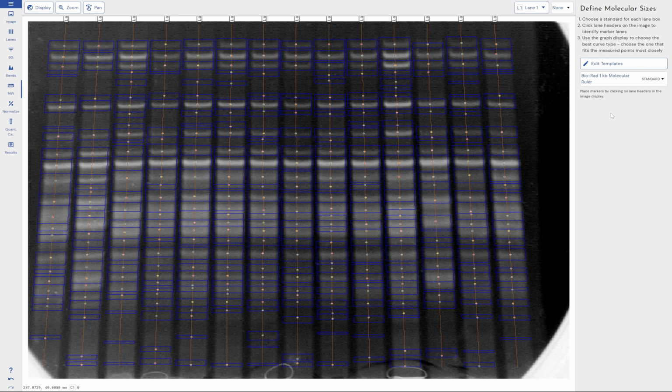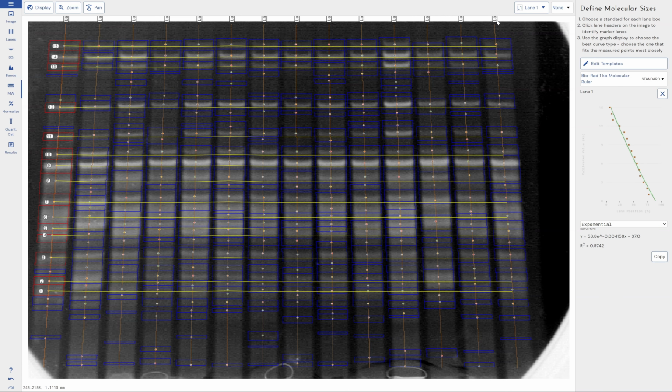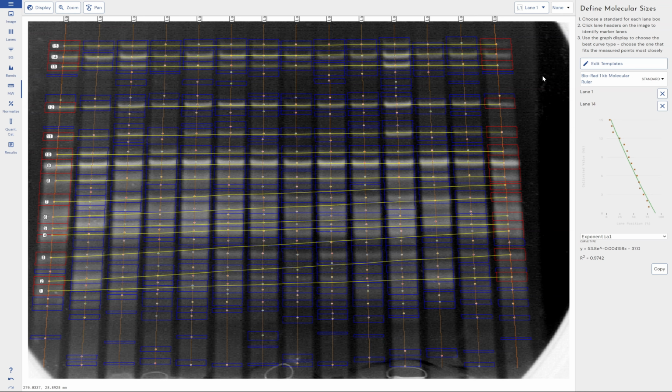So again, this is super important for people that are working in pharma companies and are producing these kind of reports to show to their superiors to prove that a quality analysis has been performed and it matches any SOPs that may be surrounding this on site. If you're working in a 21 CFR or a GMP compliant environment, this is going to be really useful to prove that you've done the analysis as you should have done the analysis.